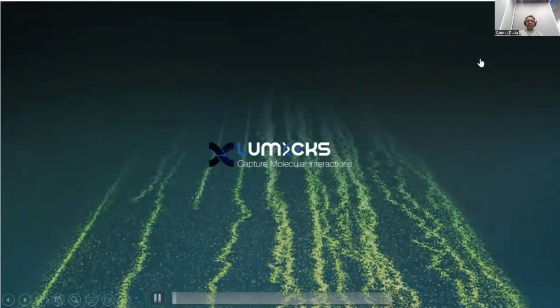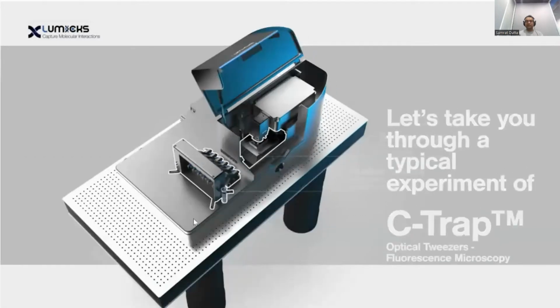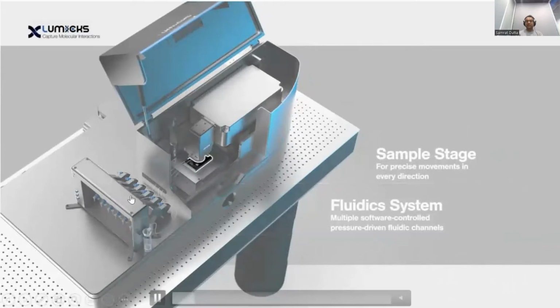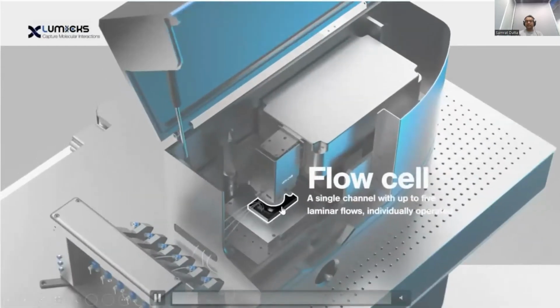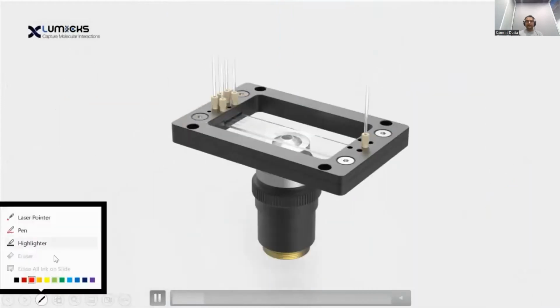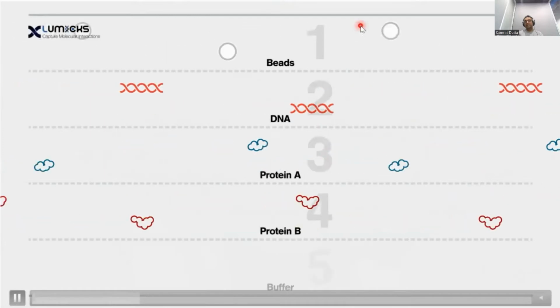So to better understand how a C-trap works, I will go through an animation video which shows the workflow of a C-trap. So this is how a C-trap looks like. This is the U-flux where the pressure is applied through the 5 channels in the microfluidic flow cell. As you can see here, there are 5 channels, and these are the schematic or animated representation of all the 5 channels.